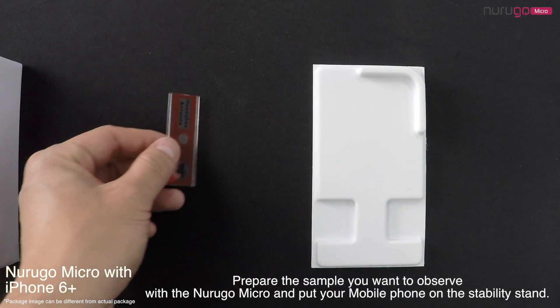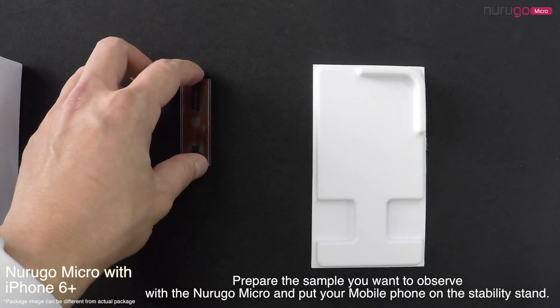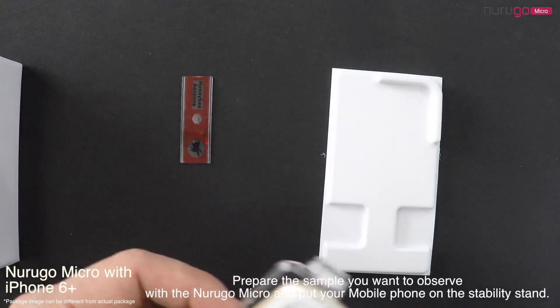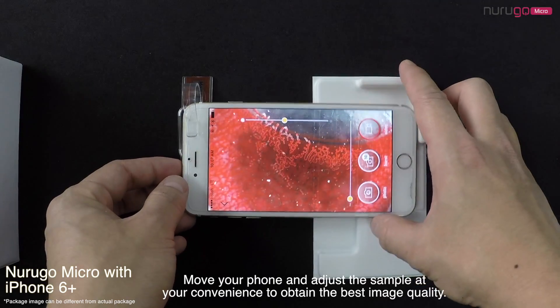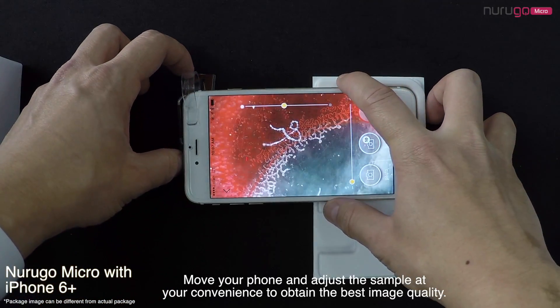You can then prepare the sample you want to observe with NeuroGo Micro and put your mobile phone on the stability stand. Move your phone and adjust the sample at your convenience to obtain the best image quality.